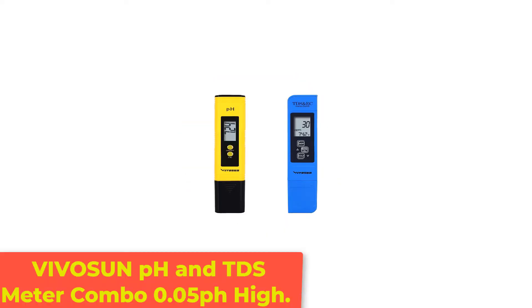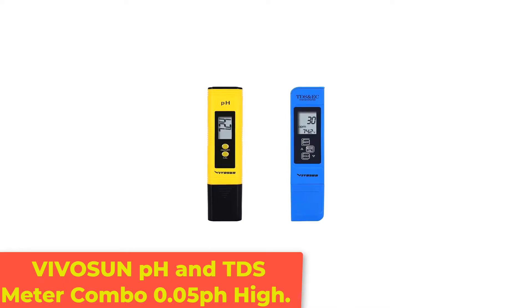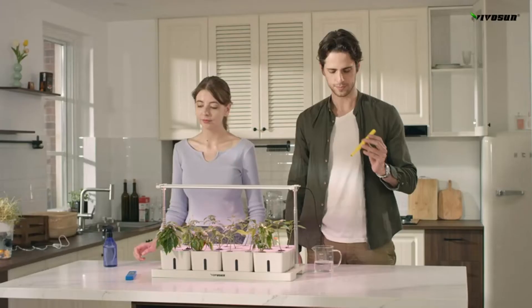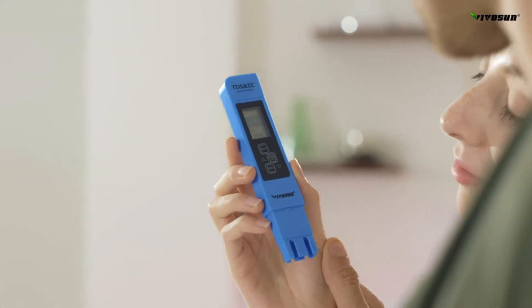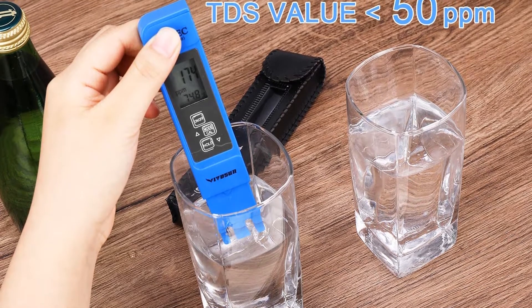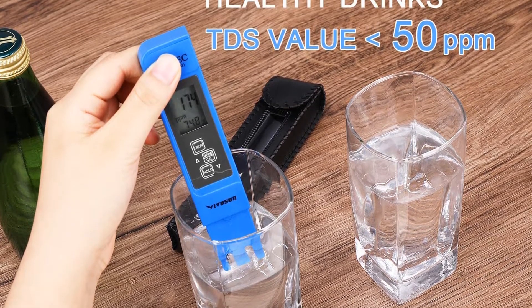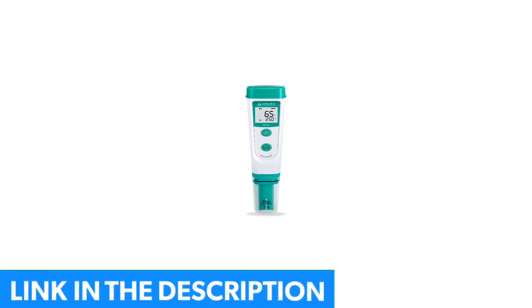Number 1: Vivicine pH and TDS Meter Combo, 0.05 pH High Accuracy. The Vivicine Digital pH Meter stands out from the rest of the meters for its excellent quality and craft. This meter is good for use in pools, aquariums, hydroponics, and food and beer brewing. One of the main good qualities about the pH meter is the great amount of ease it creates for the user.